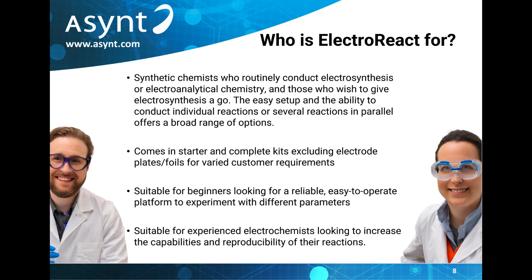For those experienced in electrochemistry, it offers the ability to increase the capabilities of their setup without resorting to homemade systems, and of course work in a far more reliable and reproducible way.